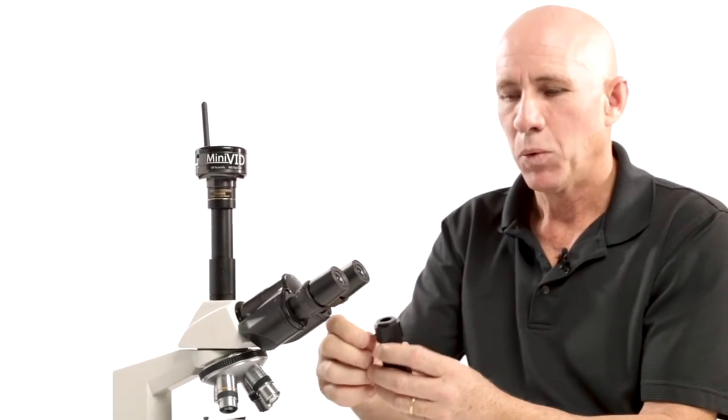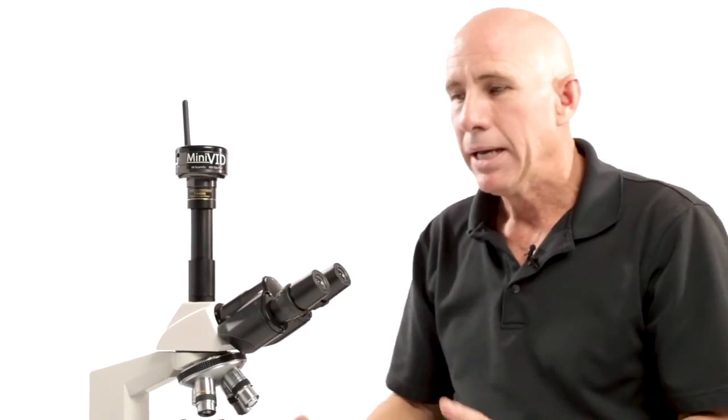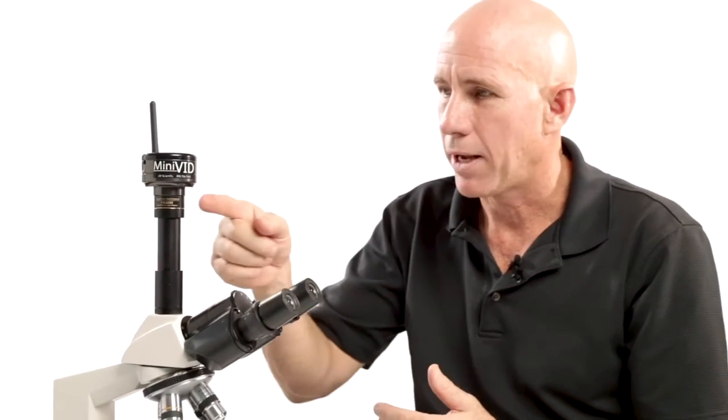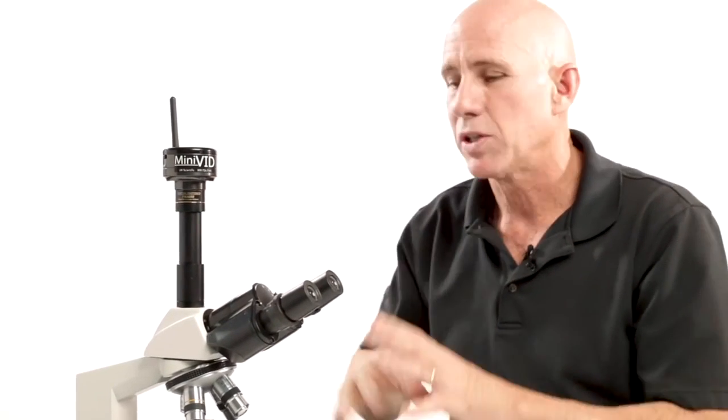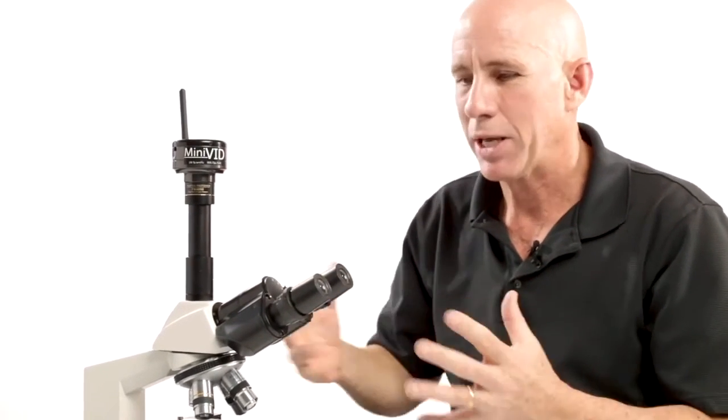Remember the par focal issue is an important one with your C-mount, and that's how you mount a camera to the Revelation 3. All of our cameras will mount just like this because all of our cameras are C-mount cameras — so we can add optical adapters to them, thread mount them, or put them into eyepieces. Whichever way suits you, we can make it happen.